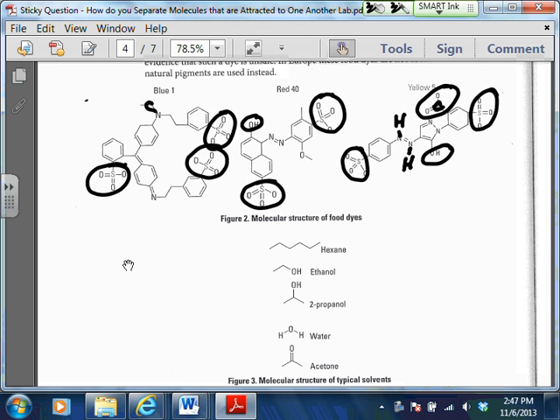Okay. So the thing that distinguishes these is the LDF forces. The blue is obviously, it's got more of the SO3 going on here, and then it's bigger. All right. So it's easier to look back on it in retrospect rather than predict it ahead of time.